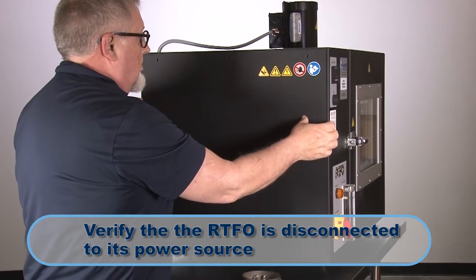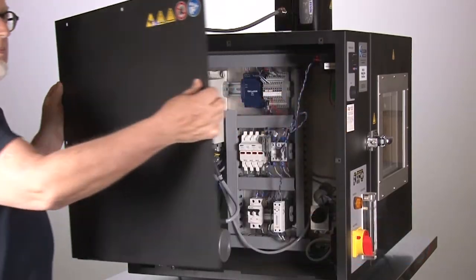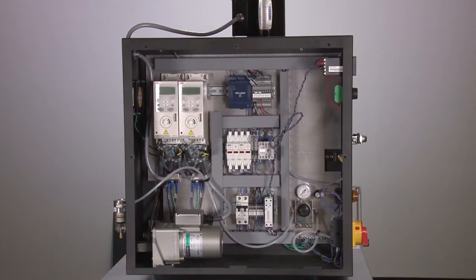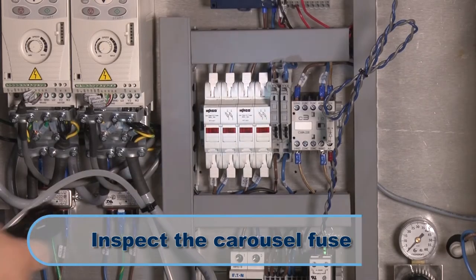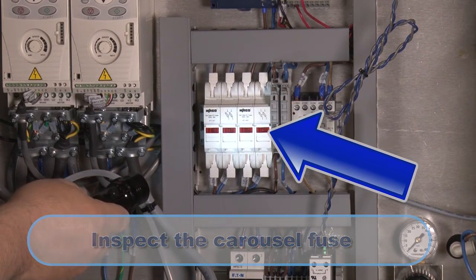Verify that the RTFO is disconnected from its power source before removing the side panels. Now we have access to the internal components of the unit. Remove and inspect the carousel fuse and replace it if the fuse is blown.